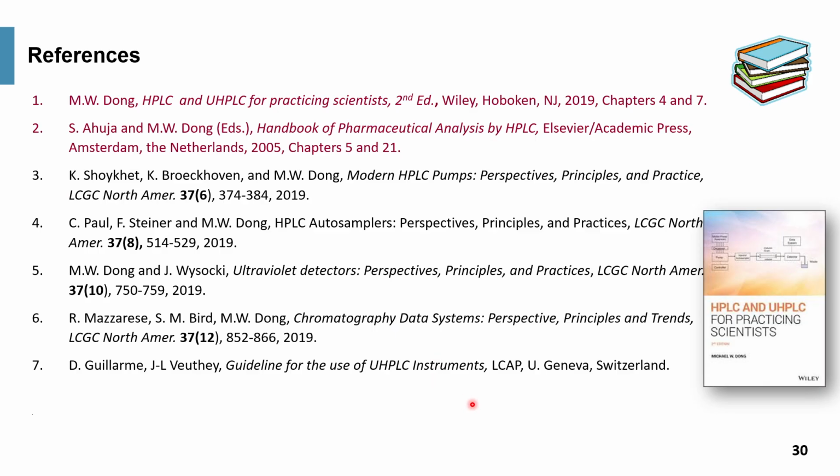Here's the set of references. The first one is highly recommended, chapters 4 and 7 of this book over here. There's also a handbook published in 2005. There's some chapters on sample preparation, and some white papers on the pump operation, autosampler, UV detector, and CDS.